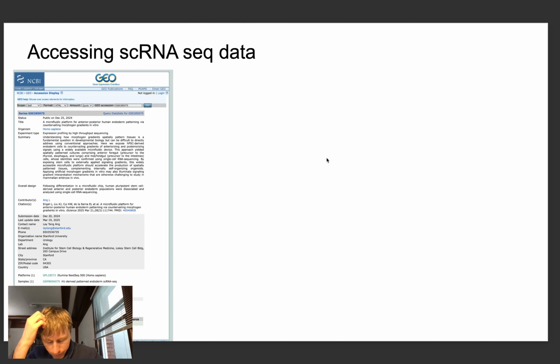And so then you have all of this, and basically you get some outcome data. Either you will use this directly, and later, if you publish your study, you will probably upload this to GEO. If you're interested in doing analysis on something which is online, in most cases you will have to use GEO to download it. In this case, you will download the file here.